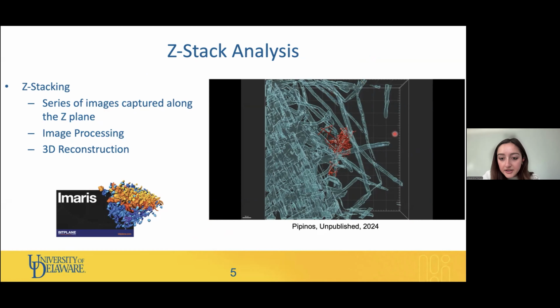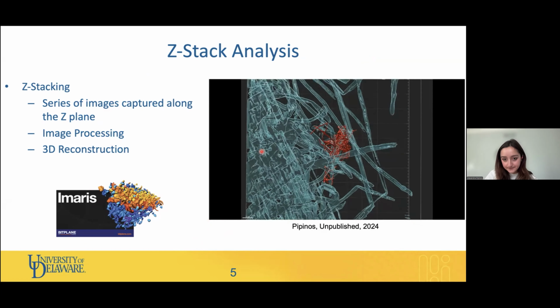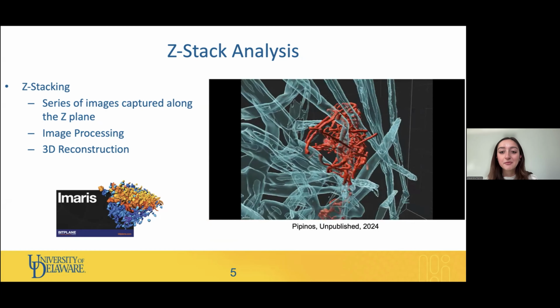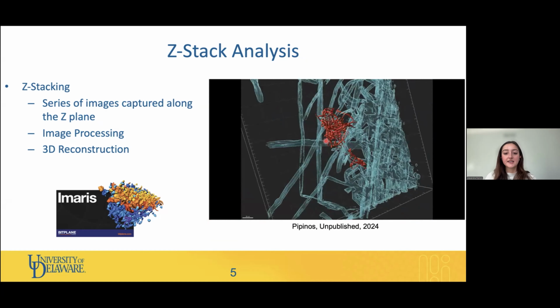I have a video, but I don't think it's going to work. Let me try. If it doesn't work, that's fine. Okay, well, I was going to show in the Z-stack video, you could see established colonization of bacteria on plant roots. So there it goes. The Streptomyces coelicolor are in red, and they are colonizing these root hairs from the spring wheat roots in this cyan color.